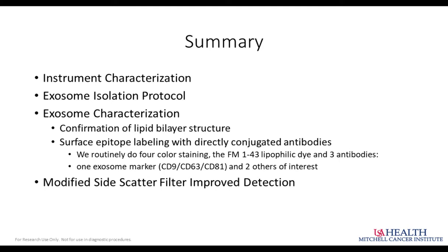So I'd like to wrap up today by letting you know that, in my opinion, exosome flow cytometry requires vigorous validation at several steps. You have to start off by characterizing your instrument and making sure that your background noise does not interfere with being able to resolve the small silica particles that are, at this point in time, the best QC material we have.